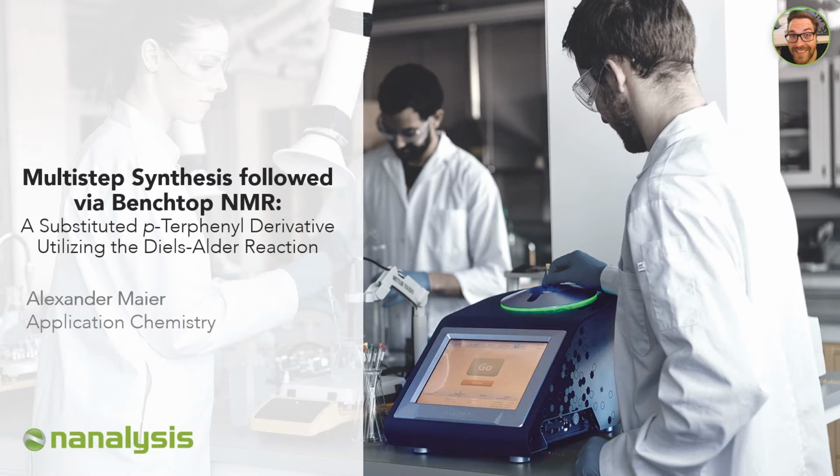In this talk, I would like to start with an introduction on integration of NMR technology in teaching. After that, I'm going to present a three-step synthesis procedure highly suitable for organic chemistry laboratory courses, where we will discuss the experimental procedure as well as the characterization of each step via benchtop proton NMR spectroscopy. After a closer look at the Diels-Alder reaction, I will close with a discussion on second-order effects and how to practically choose experiments for low-field NMR spectroscopy and academic teaching.